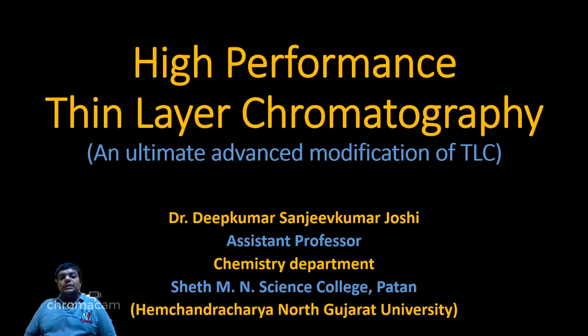Before we go on with this talk, please look into the brochure or the flyer or the advertisement you had. There is a printing mistake over there. It is by mistake written high pressure thin layer chromatography. I will justify it in our talk itself that HPTLC can always be referred to as high performance thin layer chromatography only. You cannot refer to it as high pressure thin layer chromatography.